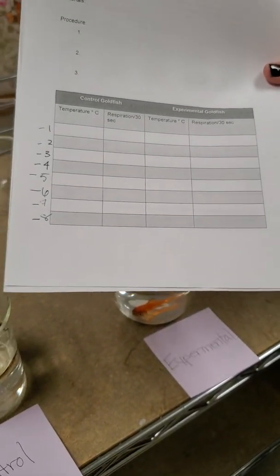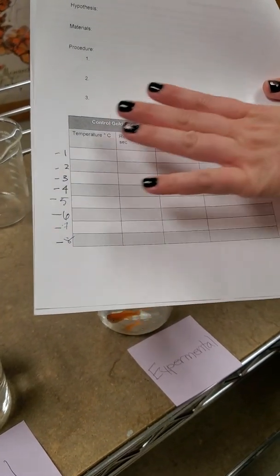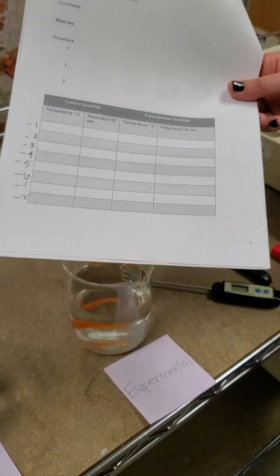And time. Okay, now all your data should be written on this graph right here. We've done it 8 times. We have our baseline as our starting one, and then fill out the rest of them to the best of your ability through the video.